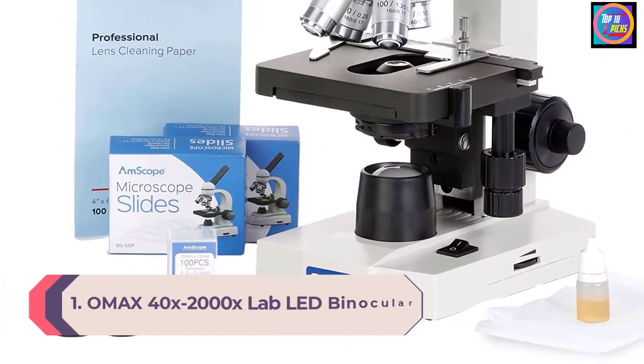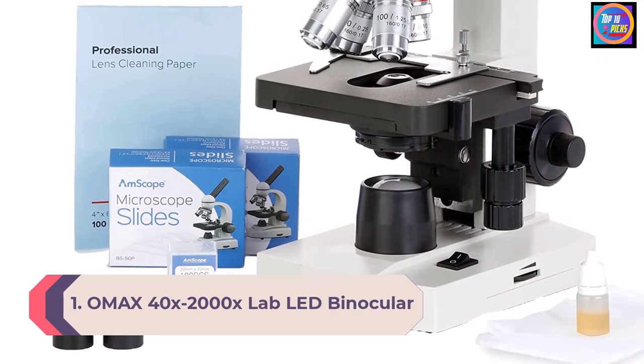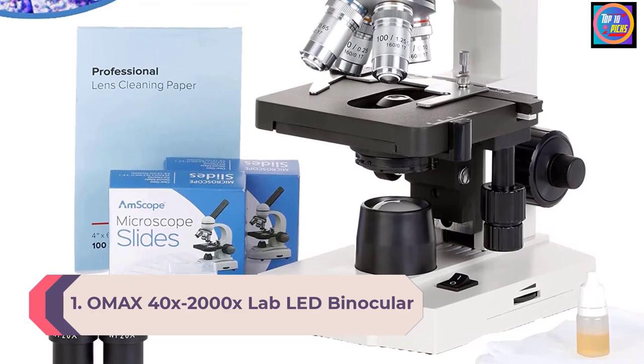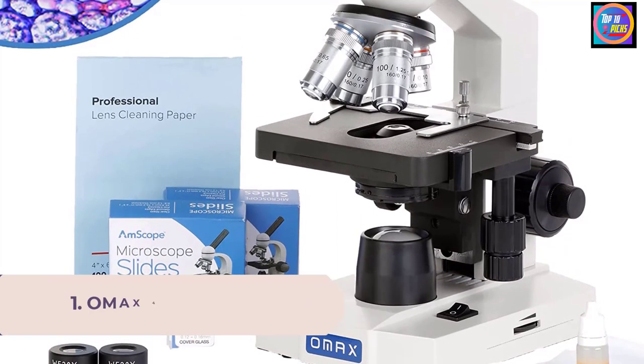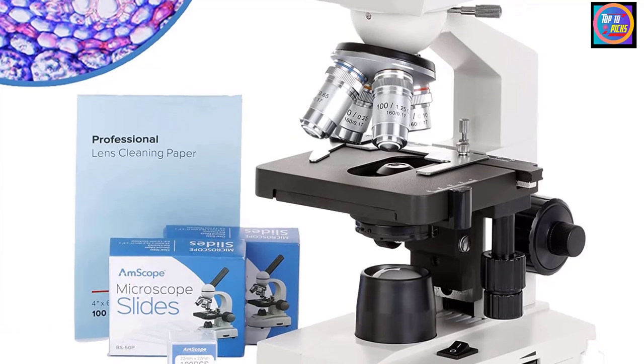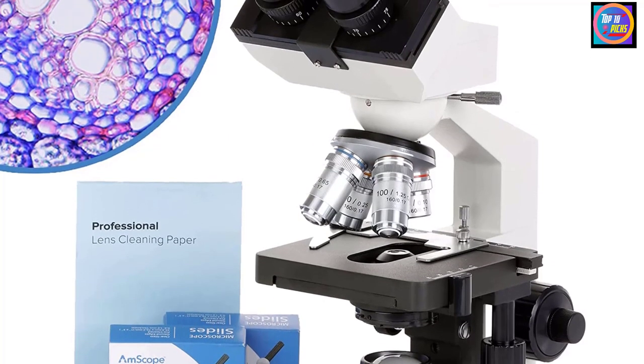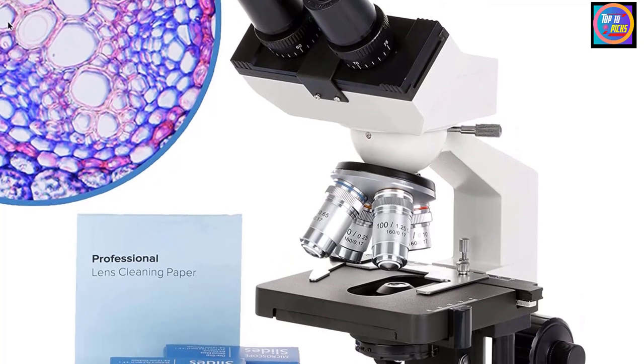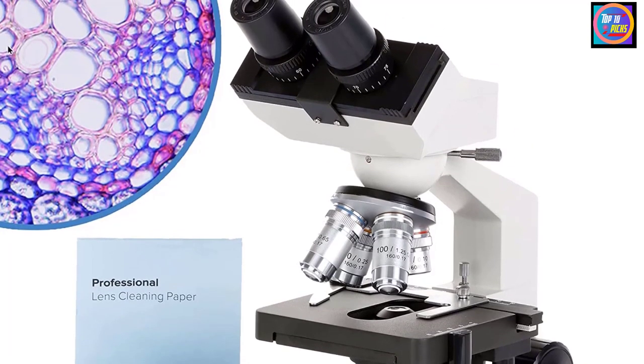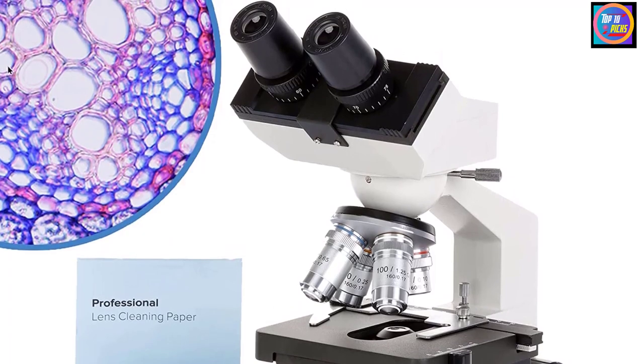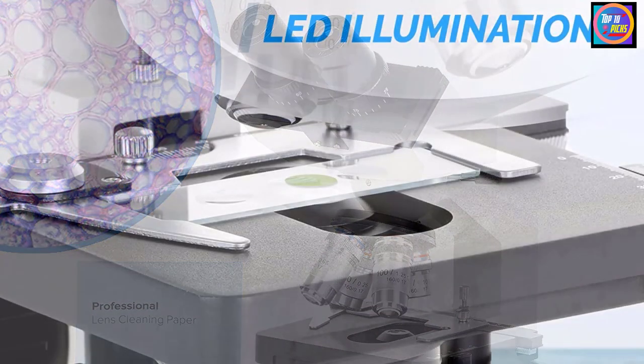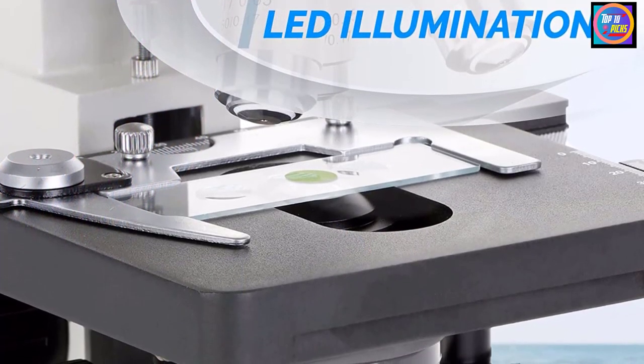Number 1. OMAX 40x2000X Lab LED Binocular Microscope. Thanks to the combination of coarse and fine focus, with the OMAX 40x2000X microscope, you are in control of adjusting how much detail you want to see from your object. The binocular offers eight different magnification levels from 40x to 2000x, so you can closely observe cells.